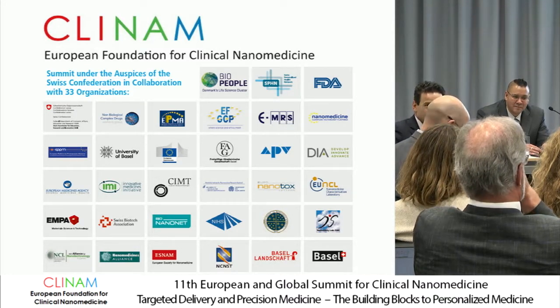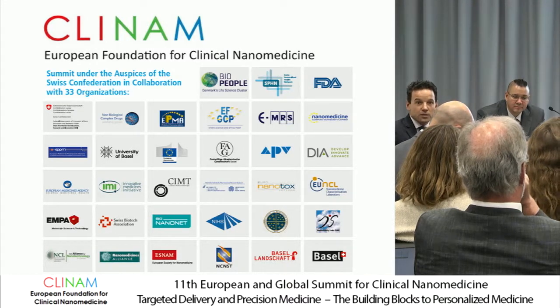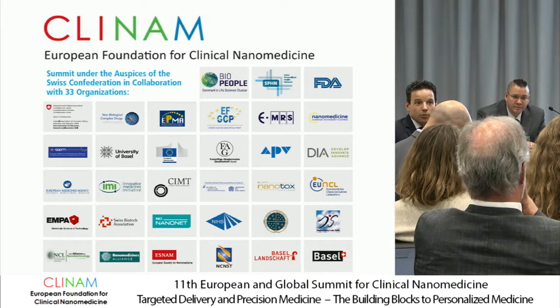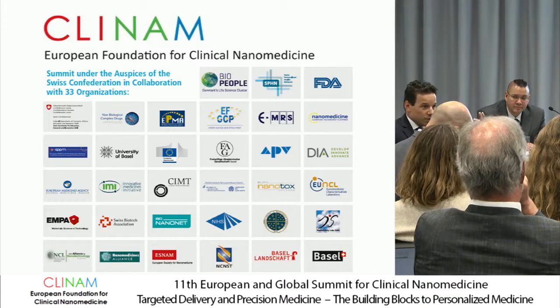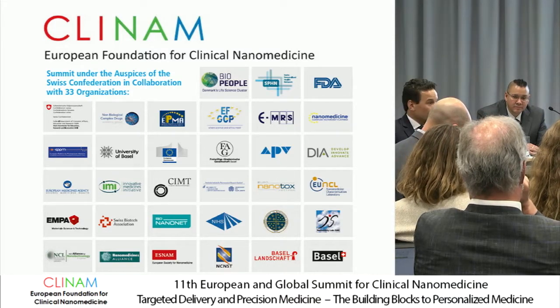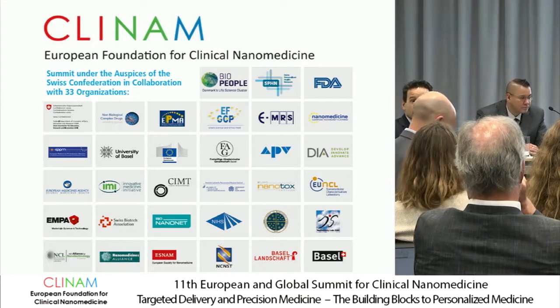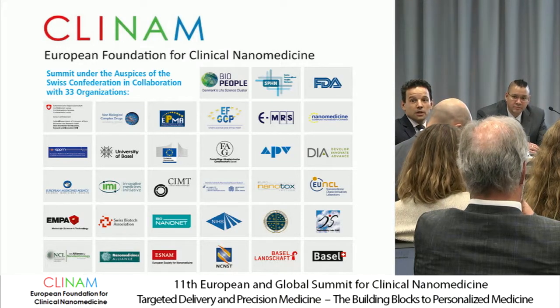So I think it's important, and it's the point of discussing, developing, implementing, improving, and creating methods, learning step by step, starting with simple models that you can use as a reference. That could be the NIST calibrators, and from there you build in, pegylated, what chain of PEG, so you're going to use 5K, use a 20K, depending on the application.